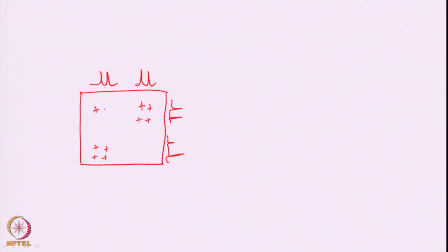And then here you will have plus minus minus plus, and then you have plus minus minus plus. So, this is the structure of the 2-dimensional COSY experiment. We call this one the cross peak, this is the diagonal peak, this is the diagonal, this is the cross, and this is the diagonal, and this is the cross. The cross peaks have all absorptive line shapes, and the diagonal peaks have all dispersive line shapes. Because of this, it has lower resolution in the spectrum. So, we discussed the consequences of this.